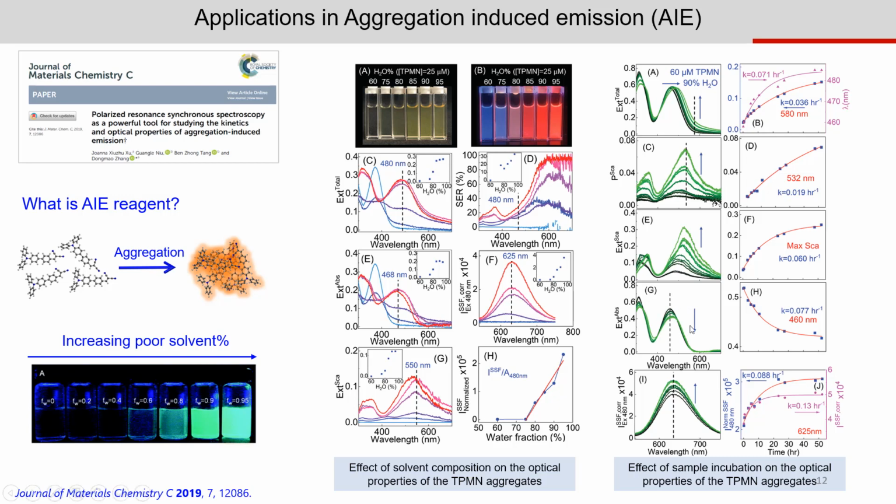However, its absorption is decreasing, which indicates the fluorescence quantum yield is increasing during the sample incubation. PRS-2 allows us to understand the mechanisms and kinetics of these processes.